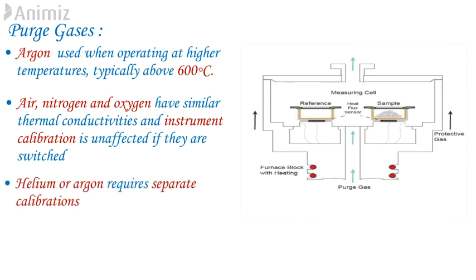For totally inert performance, use high purity gases together with a copper or steel gas line and give time for the sample area to be fully purged of air before beginning a run. Gas flows are controlled either by a mass flow controller or by using a pressure regulator and restrictor.